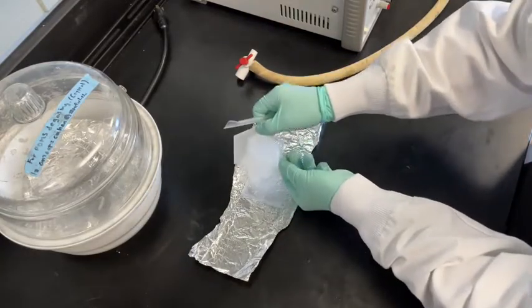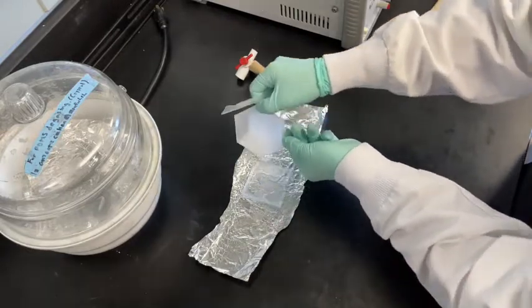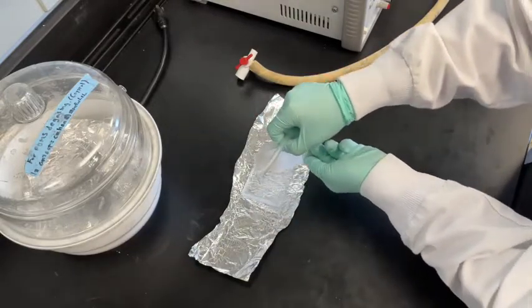Carefully pour the PDMS mixture into the 3D printed mold. Do not overfill the mold, and try not to introduce any bubbles when pouring. Spread the PDMS equally along the mold.